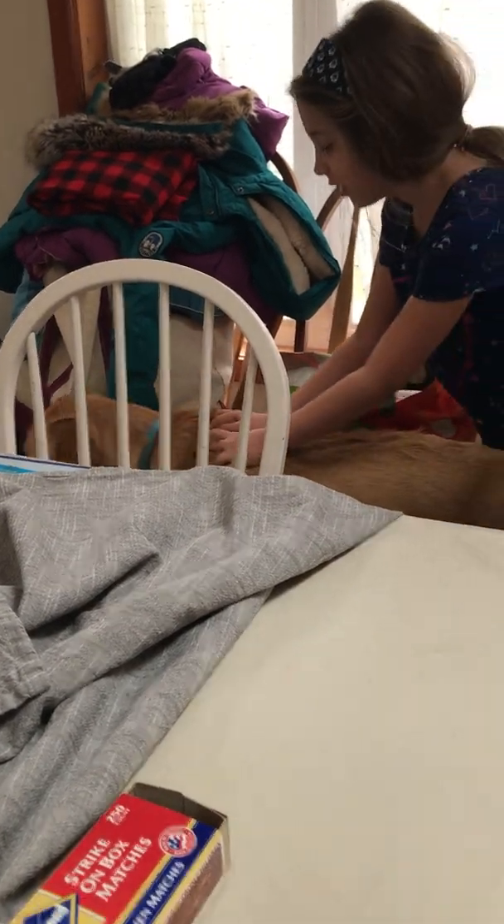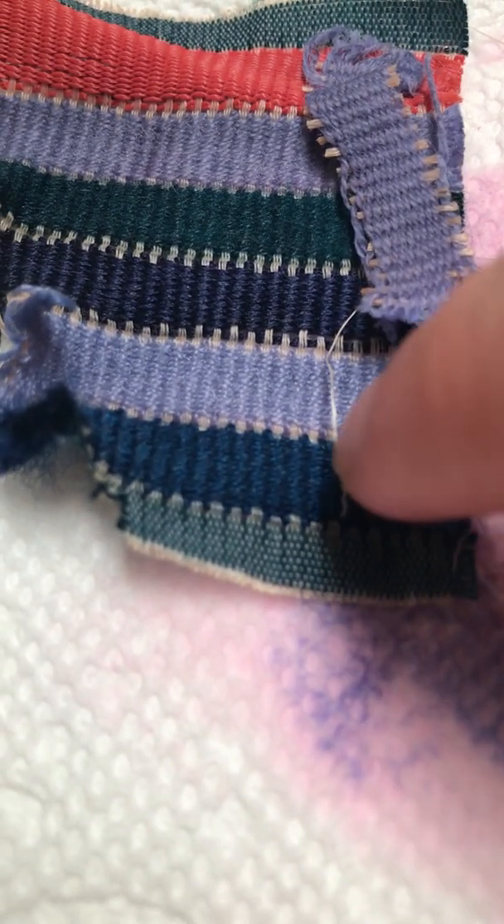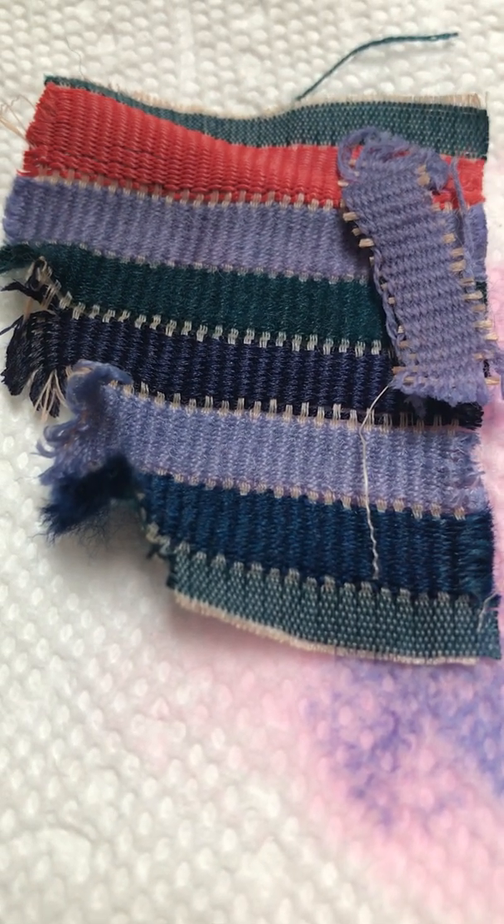Everybody say hi to Ranger. And then our last fiber is wool. So that was our dye test. Sorry about the dog interruption.